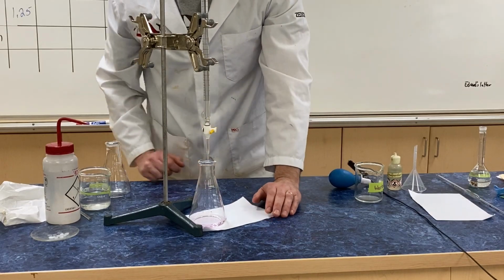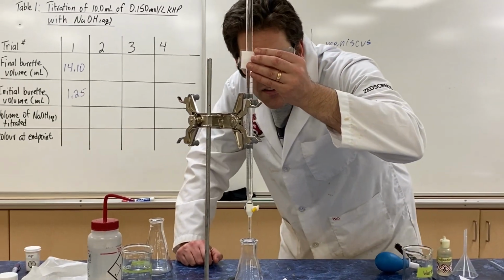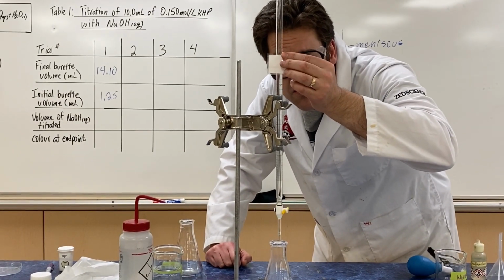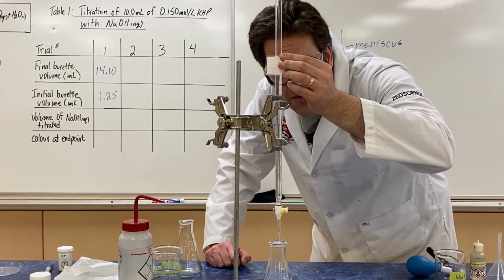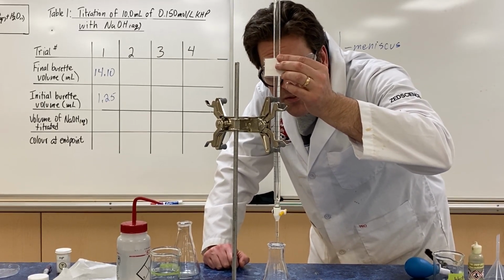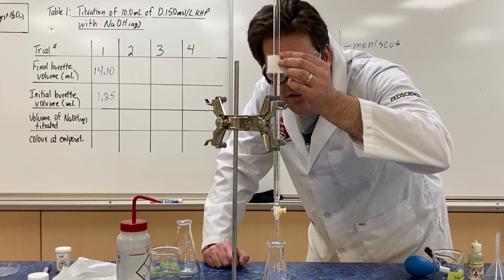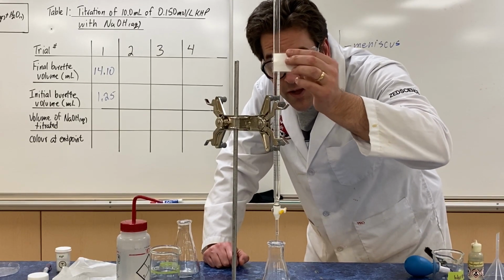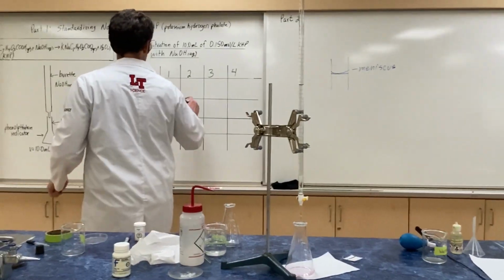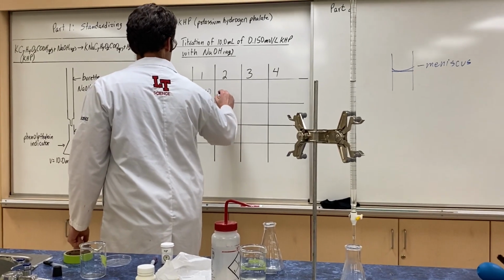Okay. So our reading is using this handy dandy thing here. Meniscus finder. Yeah, okay, so I got, each of these gradation lines is 0.1 milliliter, right? Yeah. 27.21. So our initial is 14.0.